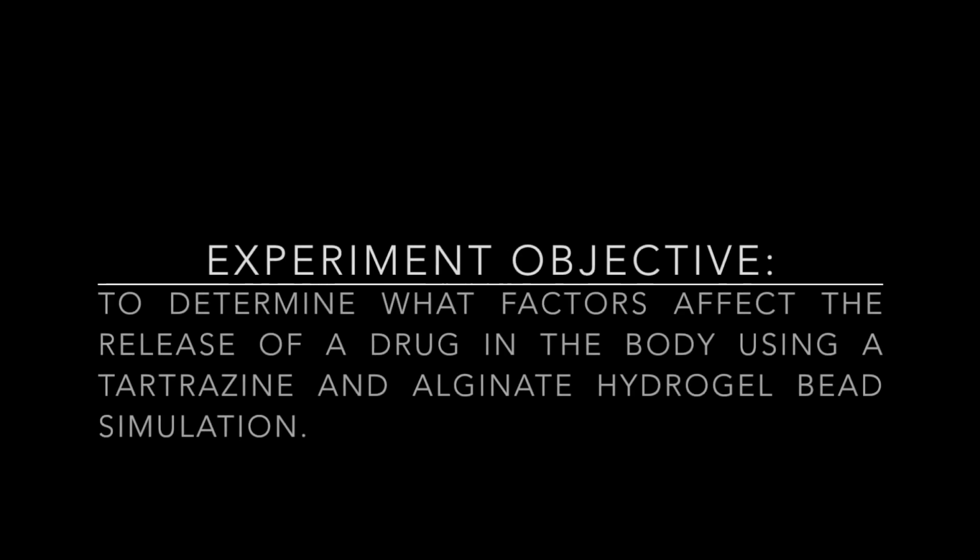The goal of this experiment is to determine factors that control the release of a drug from a hydrogel bead. The drug is simulated by the dye tartrazine, commonly used as a food coloring. The hydrogel bead represents the capsule. Our goal is to determine which conditions lead to the greatest fraction of dye being released.